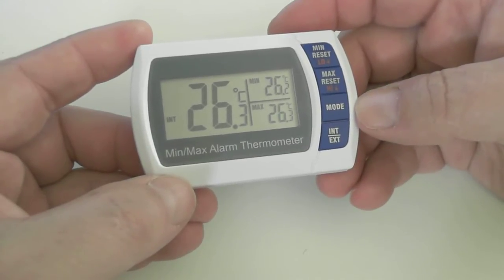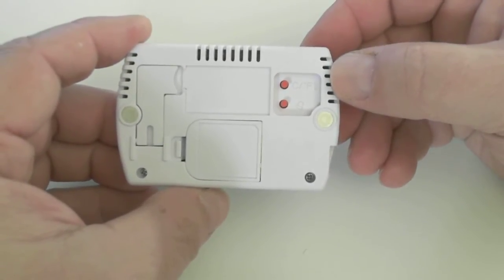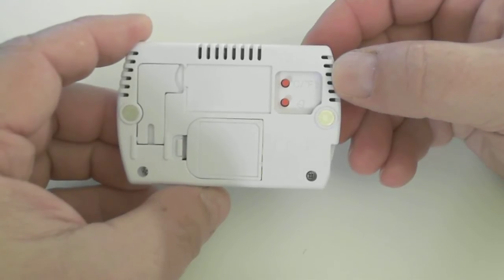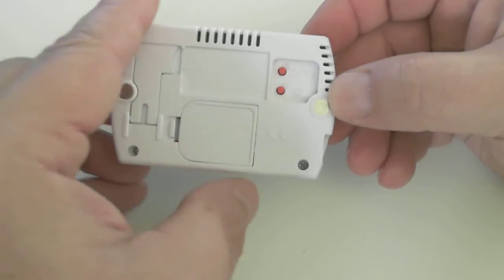Let's do a quick overview of the ACC850. Turn the unit over. On the back you have two buttons. The top is to select either your Celsius or Fahrenheit scale. The lower button is to deactivate the audible alarm. This compartment is for your battery.